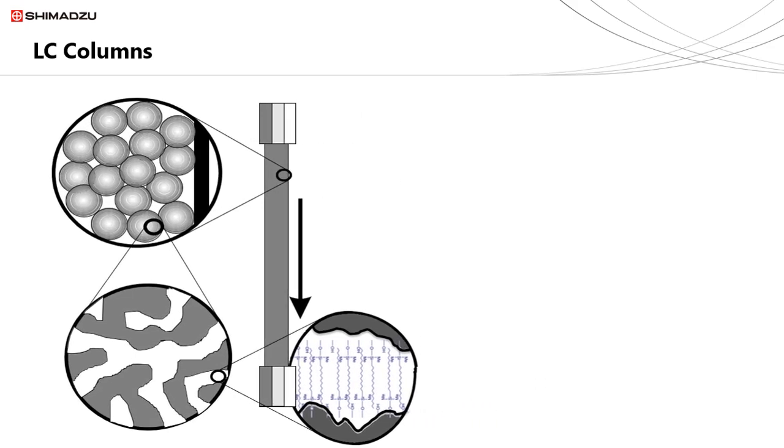These functional groups are represented in the column types, such as C18 or phenyl hexyl. Our choice here is a C18 functional group. This will differ in its functionality from a phenyl hexyl for different compounds. So knowing the compounds of analysis is vital.